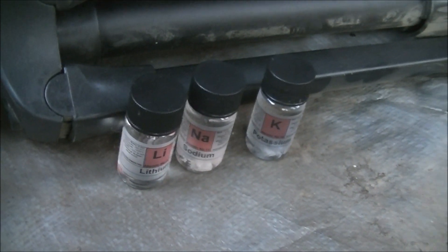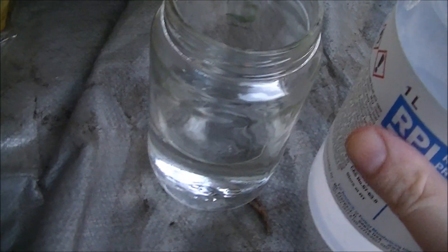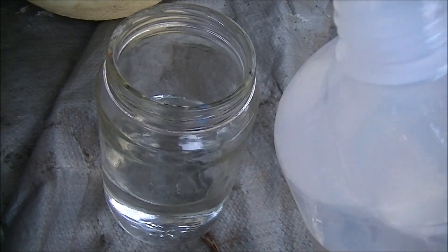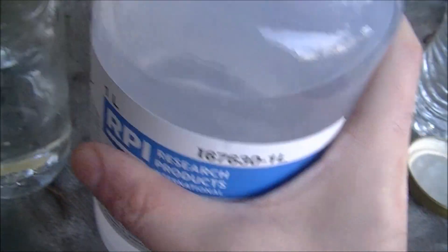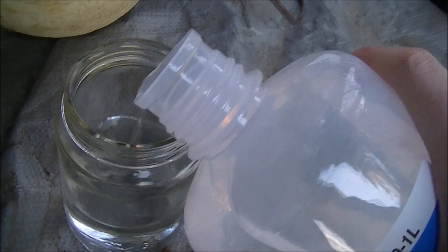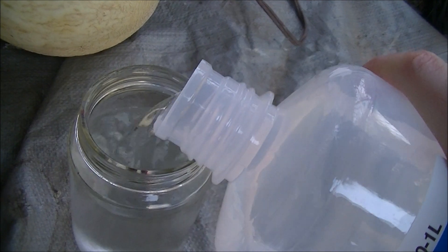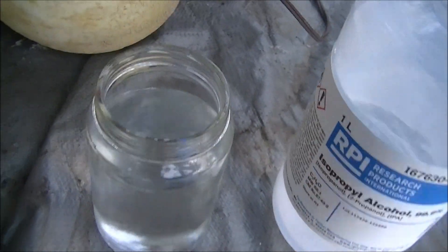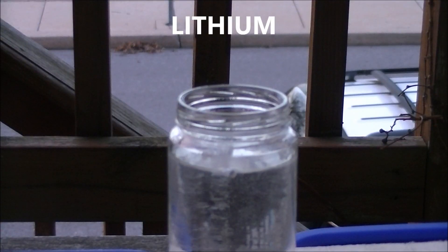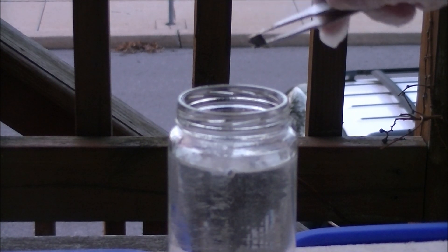You likely saw alkali metals being dropped into water. Well now, I'm going to be dropping them into a mixture of alcohol and water. Our first metal is lithium, the least reactive of the alkali metals.